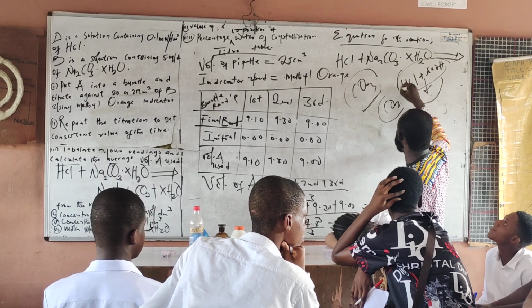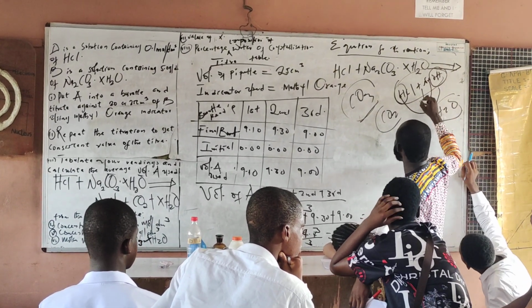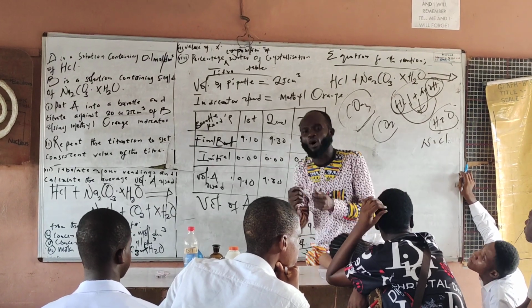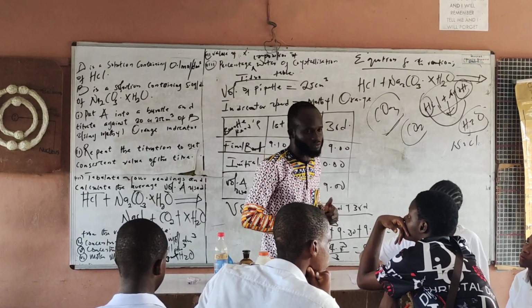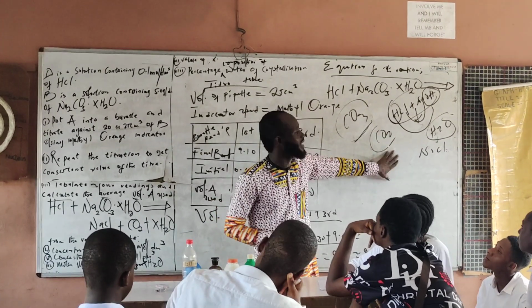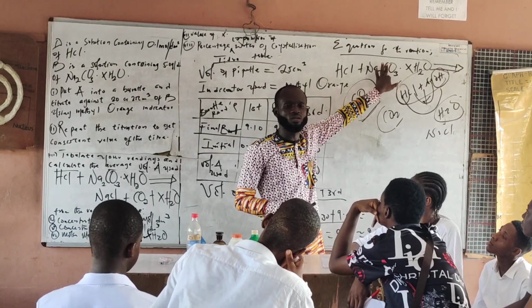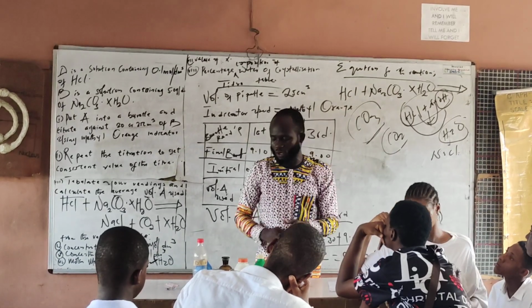Listen, the hydrogen will come out this side and they go for water. Then sodium will come out with what? Chlorine, they go for what? Sodium chloride. Will be what? Your table salt or common salt or domestic salt or your house salt. And in this one, there's no carbon(IV) oxide. Why? Because there is no trioxocarbonate(IV) radical present in the salt. Are you following?